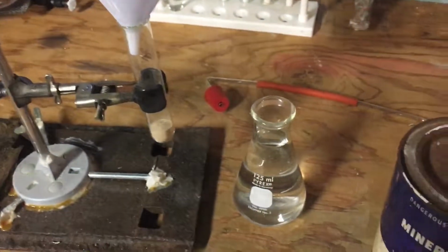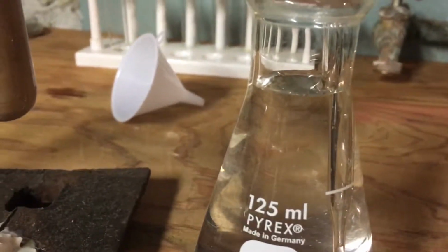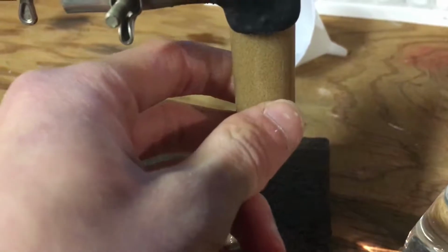Alright, let's test this. Alright, so I've added my water to the sample, and it actually is, or rather, it just was producing acetylene gas. Oh no, really? As soon as I turn on the camera? Come on. Let's see, is there... Oh yeah, there's a bubble coming.